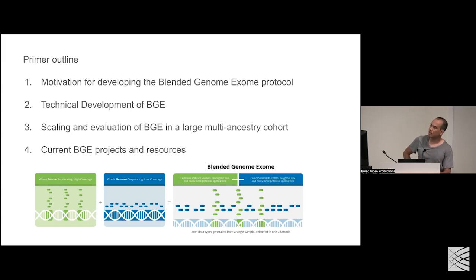Below is a nice schematic picture that Broad Clinical Labs made that hopefully gives you a little bit of a sense of what's going on in terms of the exome portion, the low-pass genome, and then blending them together to give you this current product.